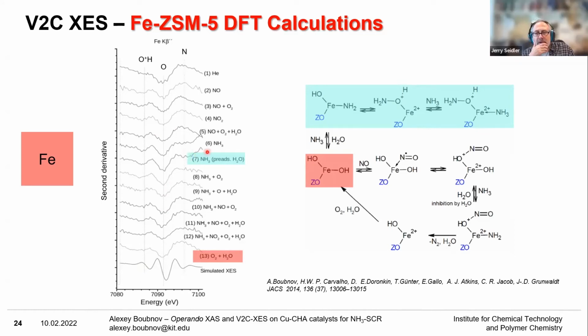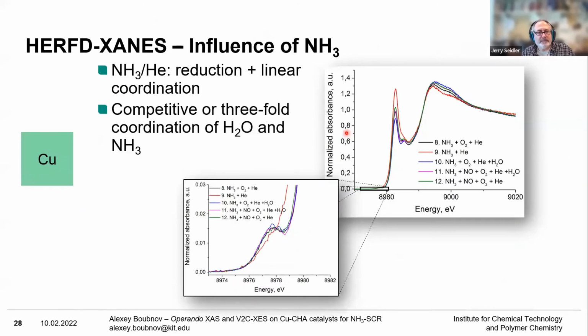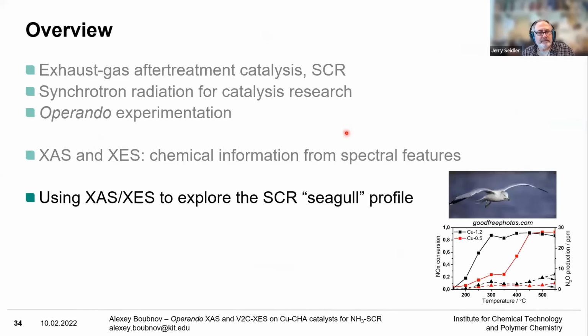Okay. Thank you. You should continue, please. Okay, so here's the final part of the talk. Based on all the information that we have from X-ray absorption and emission, I will now focus on the copper side, on the copper-based catalyst, to explore this seagull-shaped profile of the conversion curve.